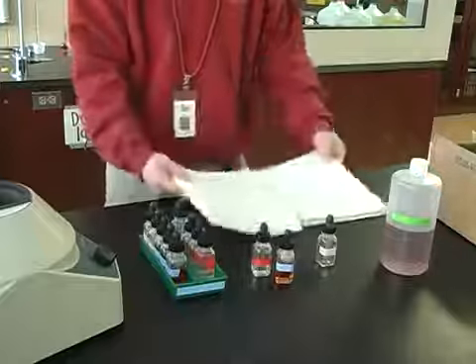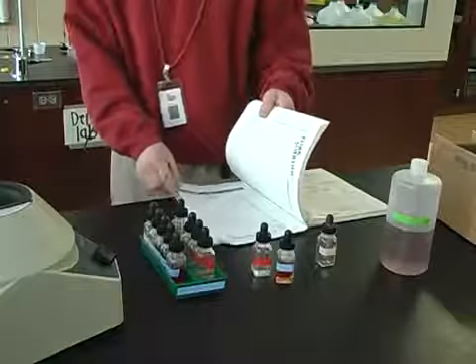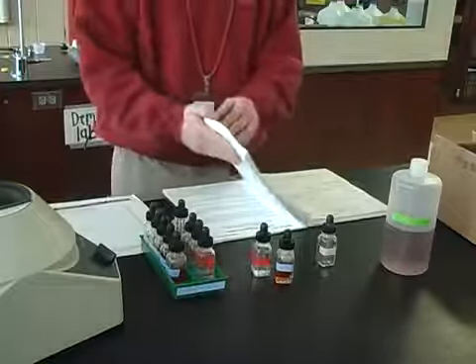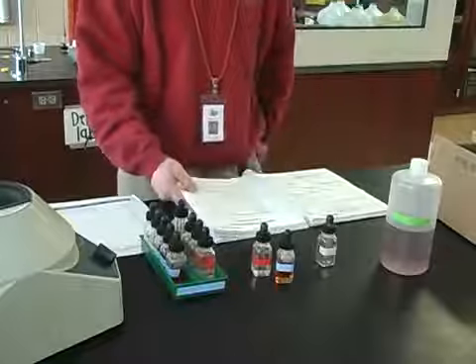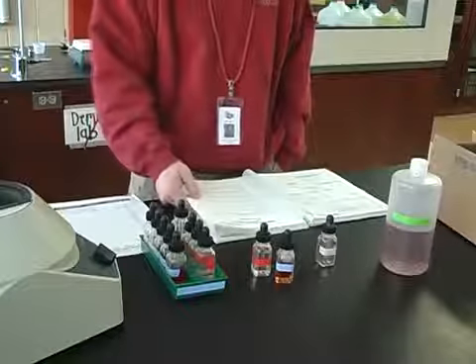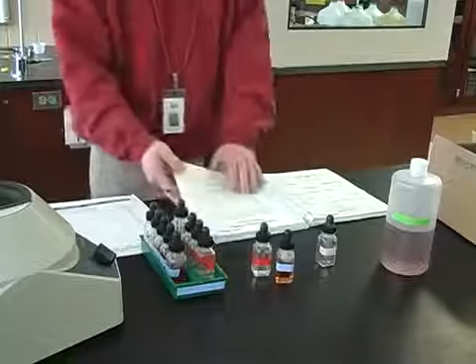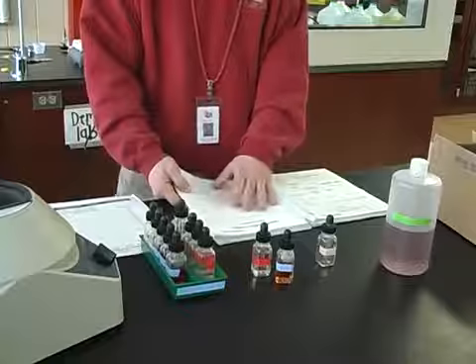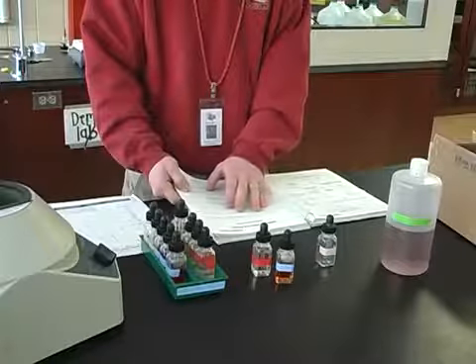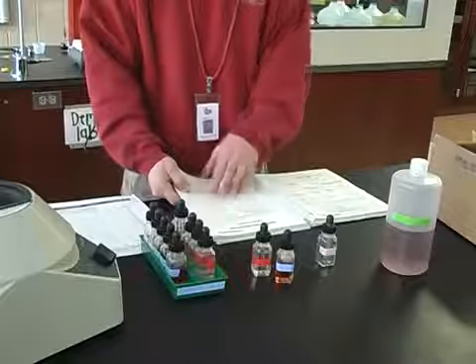So preliminary lab assignment. On mine it says page 137. Yours it's page 99, is that right? Page 99. So question number 1 says, use the flow chart at the end of the experimental procedure to answer the following questions. In each question, a test is carried out to determine the presence or absence of several ions. Only those listed may be present. State if the test indicates if each ion is present, absent, or undetermined.